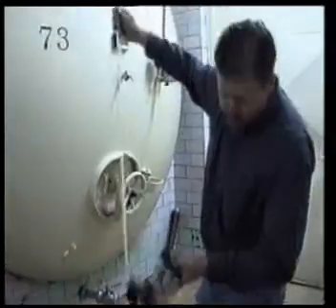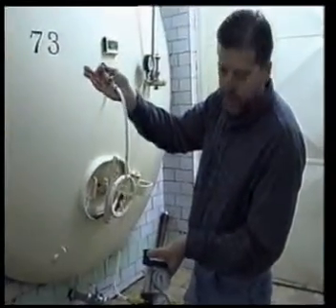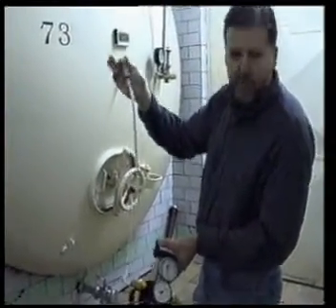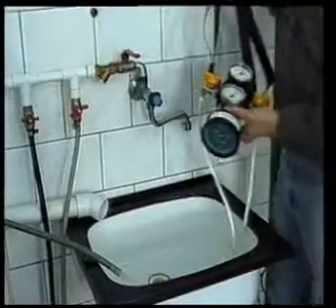Once you get all the beer out, you can go straight to the next tank if you want to take a reading on another tank, or if you're done for the day, you can rinse it out with water.